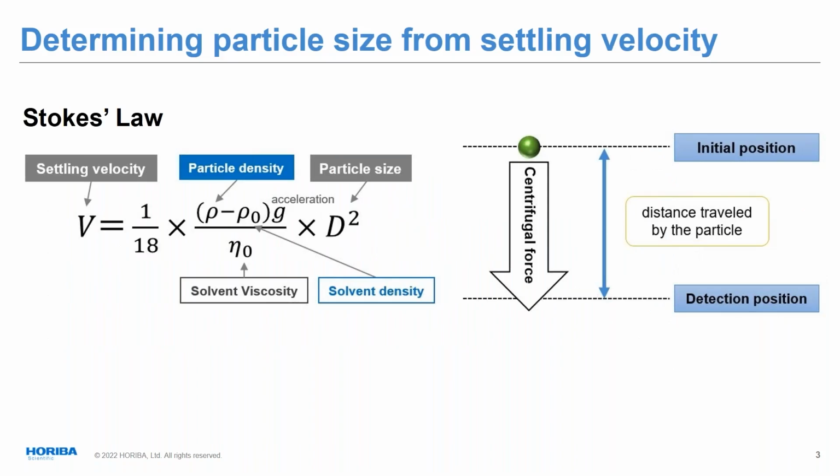Now, this is where it all starts out. The equation we have set up here is for gravity sedimentation, where, as you can see on the right-hand side of the equation, you would have essentially 1g of gravity. We'll also take a look at the centrifuge situation, where instead of 1g of gravity, you can select a number of g's by selecting the centrifuge speed. So we'll show you the benefits and some of the things that our new system can do there.